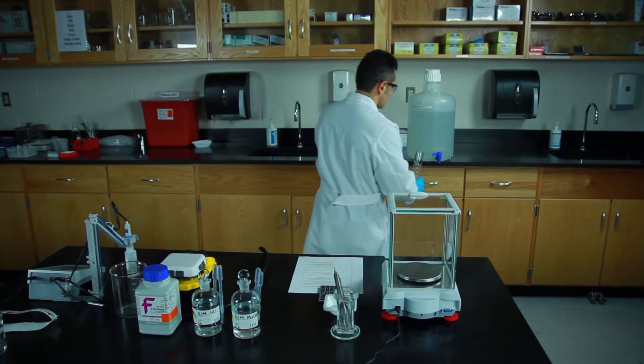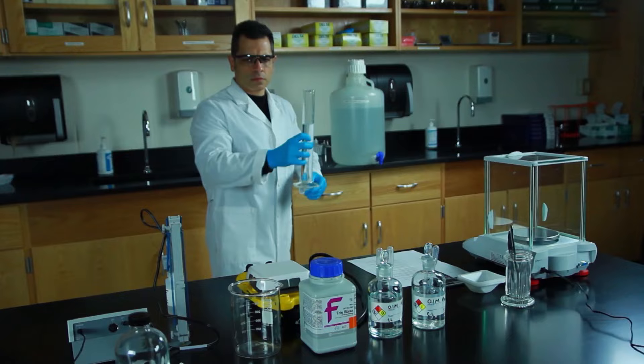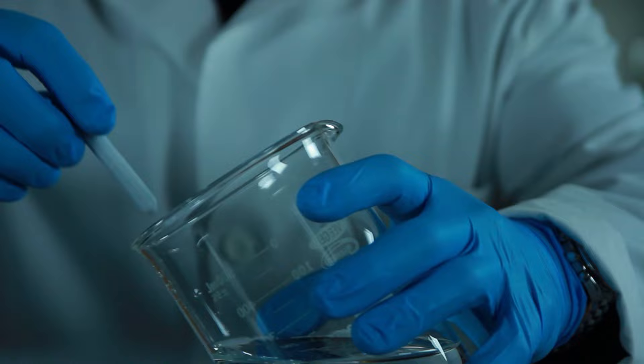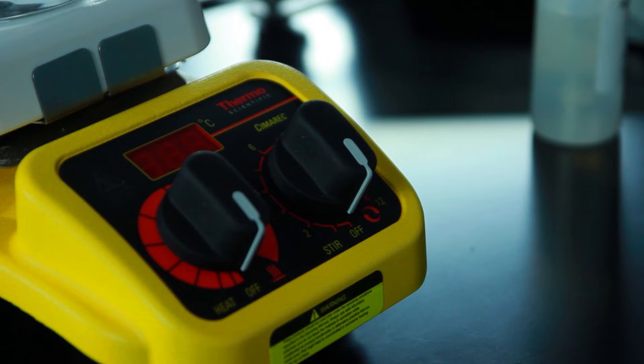The first step is to add approximately 210 milliliters of water to a 250 milliliter graduated cylinder. Transfer the water from the cylinder to a 600 milliliter beaker. Add a stir bar and place the beaker onto the stir plate.